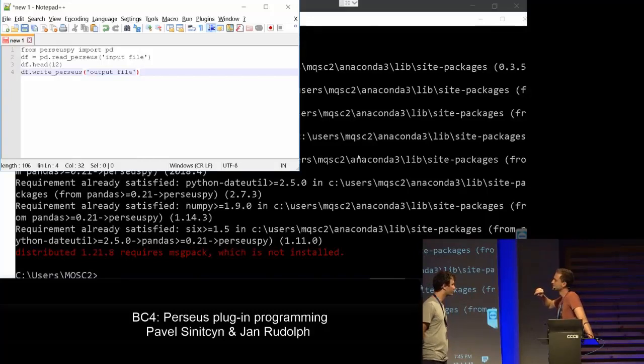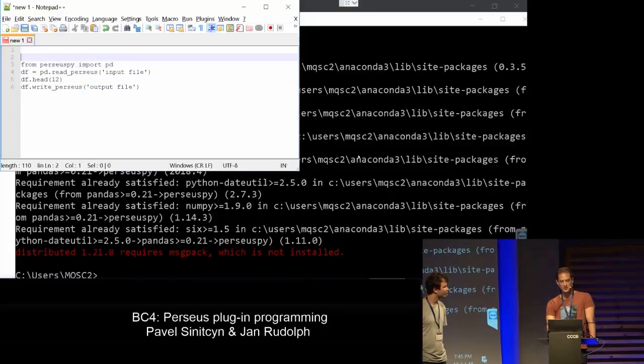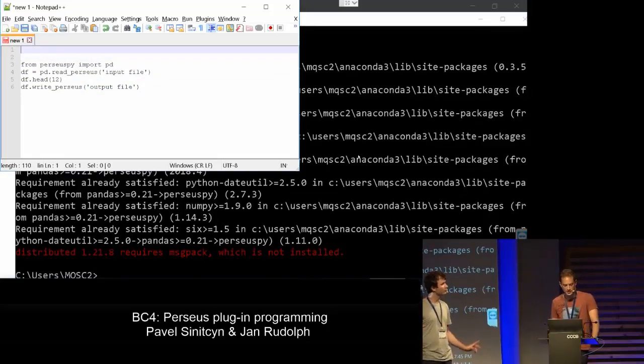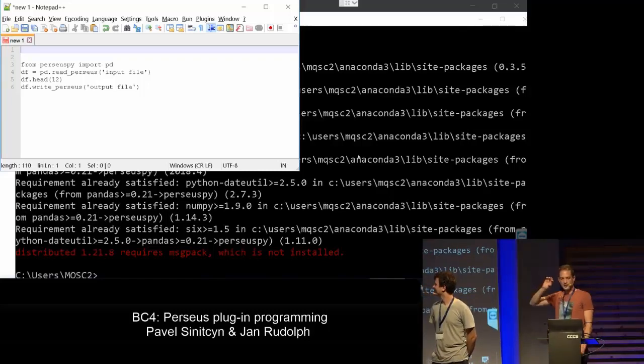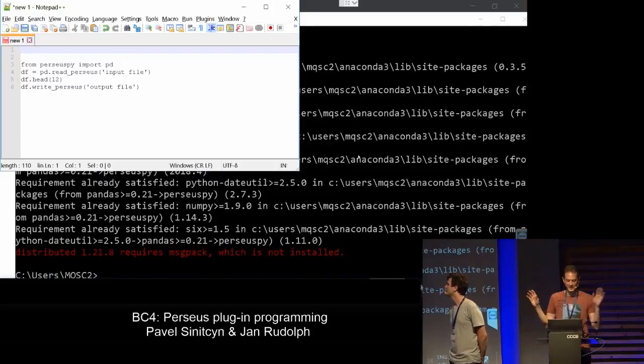And just this or more? A few more things. But not the whole of Pandas' possibilities? I mean, this pd is the whole Pandas. You can do everything. It's a monkey patched version. So these few lines of code that I just wrote are really the core functionality. And now we need to do the piping, which is always the more boring part, but it's also important.